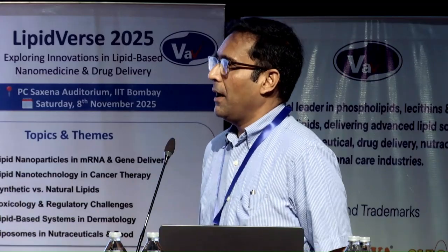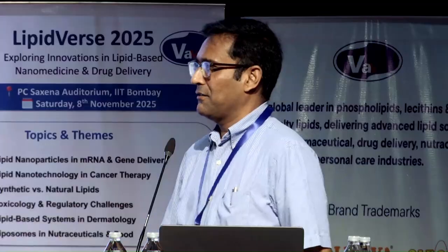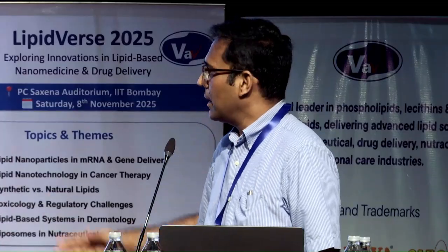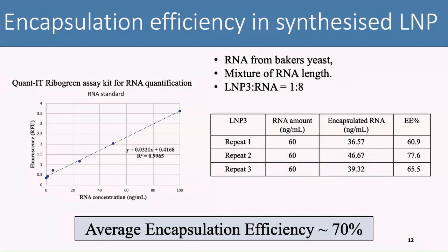So the microfluidics will give you about 95%. Yes, I'm very much aware of that. That's why I said, as I just mentioned, 70% is not acceptable. But as these are results of the last couple of months or so, we are trying to optimize it.